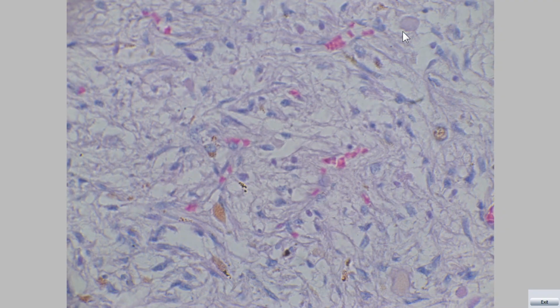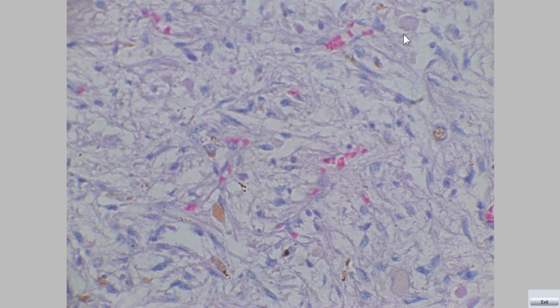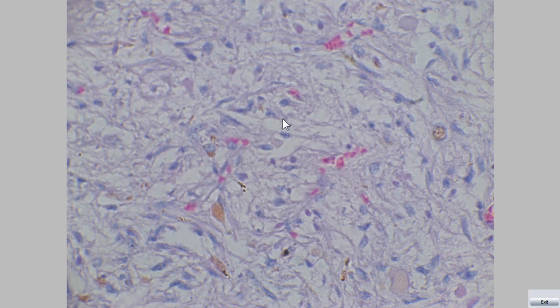This is another one. This is considered a characteristic feature of this region. Okay? So the cells are pituicytes. This structure is the Herring body. Pay attention, these are the things required of you in the exam. Herring body, axonal dilation, accumulates hormones. Pituicytes, modified astrocytes.